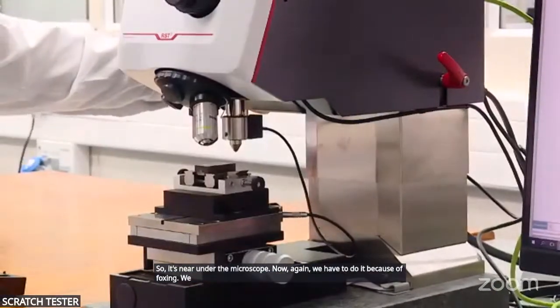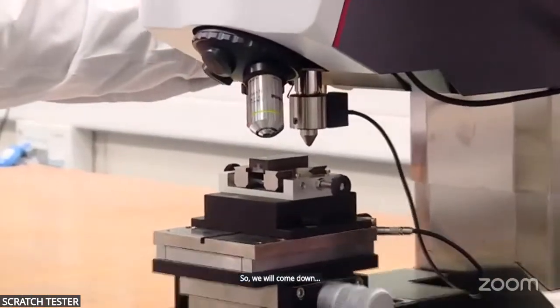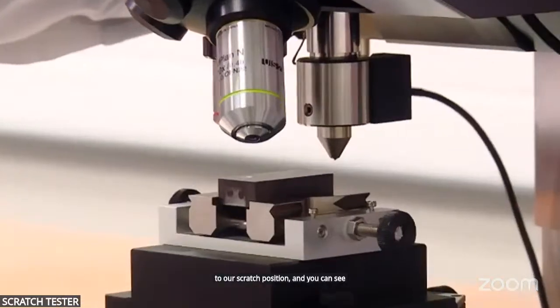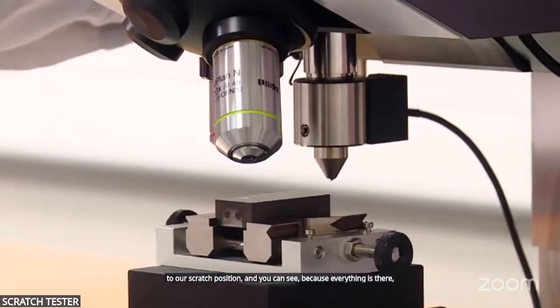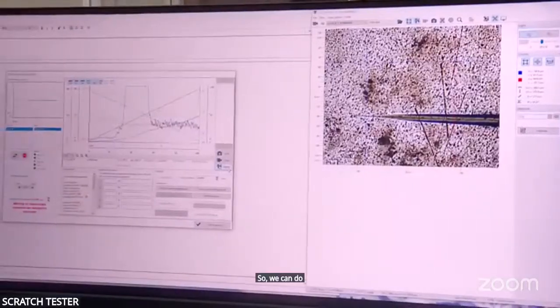We are up, so we will come down to our scratch position, and you can see because everything is there, we are near to the scratch itself. So we can do fine adjustment by this smaller knob, and coarse adjustment is via the bigger knob.